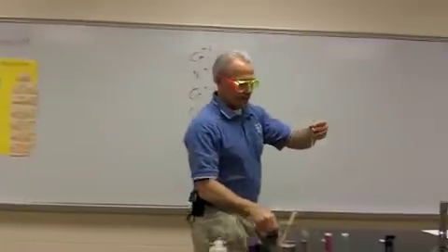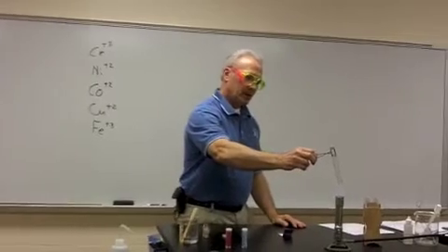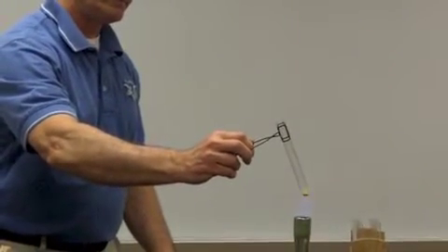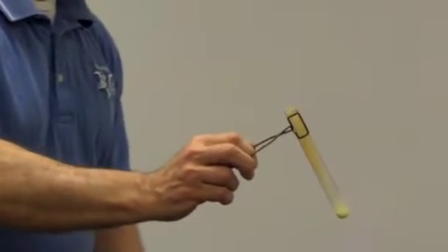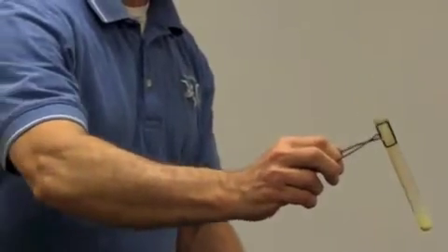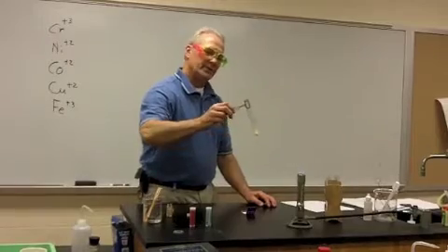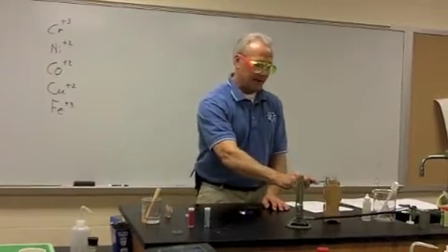So we'll go ahead and heat as directed, looking for the production of a colored gas to see if that occurs. And it looks like we do get a brownish gas produced in this particular one. So that is another significant clue. Heat it just a little bit more. Yep, so we saw the brown gas produced. So that is a really good sign. I'll give you a moment to jot that down in your data table.